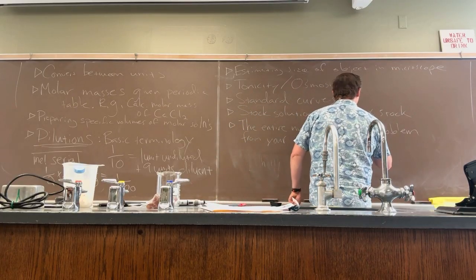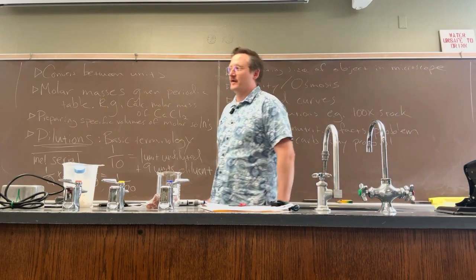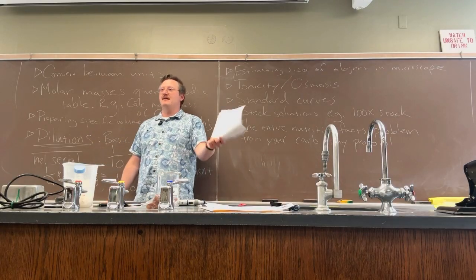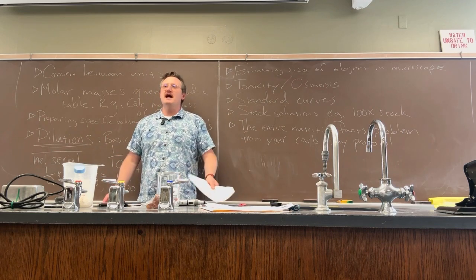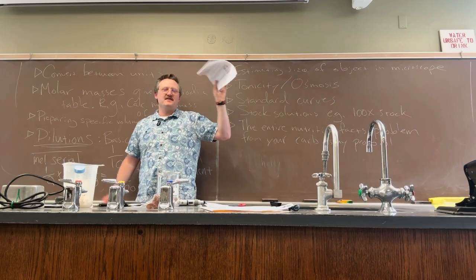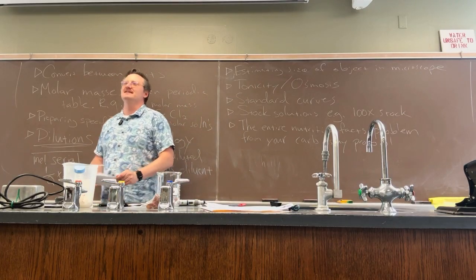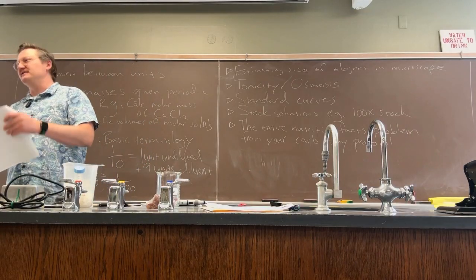At the end of the carbohydrate assay protocol, there's a practice problem where there's a nutrition facts sheet, and you have to fill it out. I have to figure out how much do I dilute this to make it fall on a standard curve. I rewrote it for the lab midterm because I think that brings a lot of things together, and I like that question. I like it, and I'm not getting rid of it no matter what you say to me.